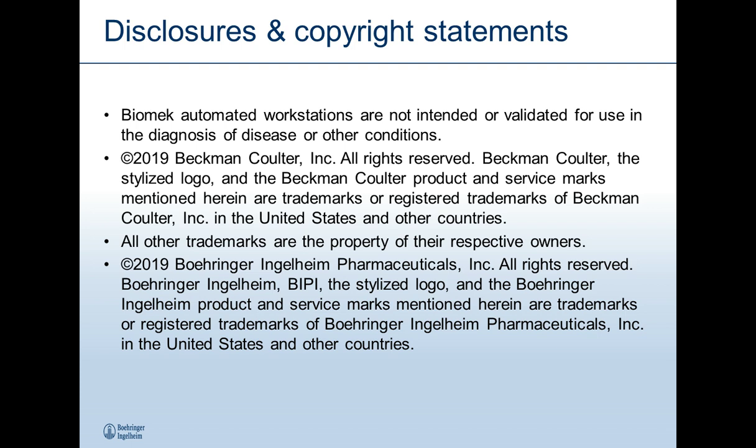How do you go about troubleshooting an automated assay? Oh, very good question. This is a primary reason why benchtop to automation transfer is so vital.